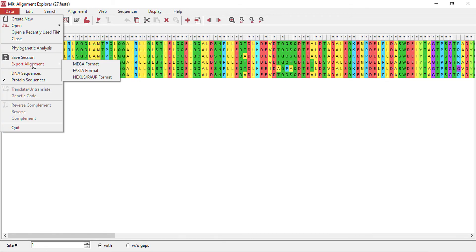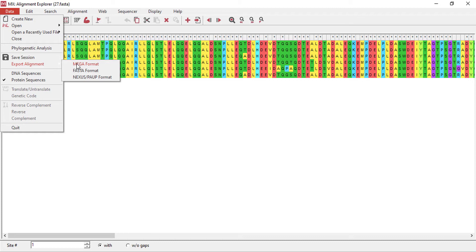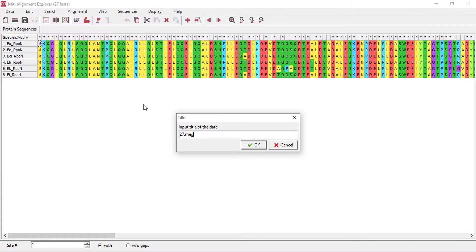This was basically the FASTA format of my protein. Now I need to export this alignment as mega format in order to construct a phylogenetic tree and save it in the same folder. It will ask me to change the name. The mega file has the extension of dot meg. This is the title of the data.